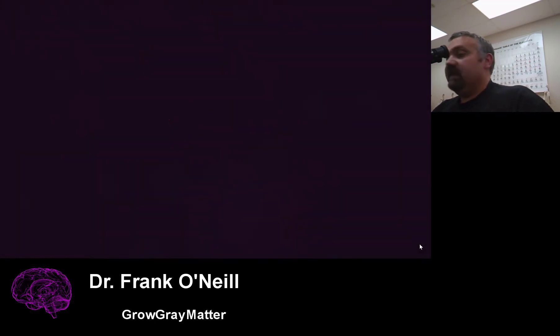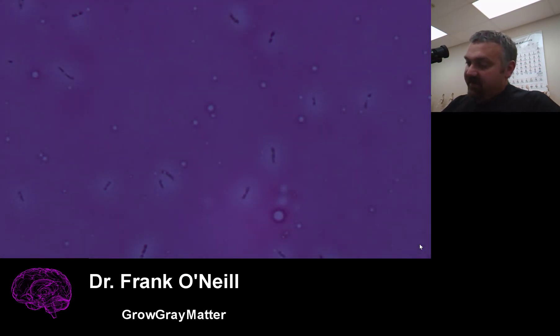And now let's try to take a look. I'm going to have to tweak the lighting a bit so you guys can see it. And voila. So I'm going to move what's called the iris diaphragm a little bit, just want to make sure I can get this tweaked as much as I can. The iris diaphragm is part of the condenser in almost all microscopes.